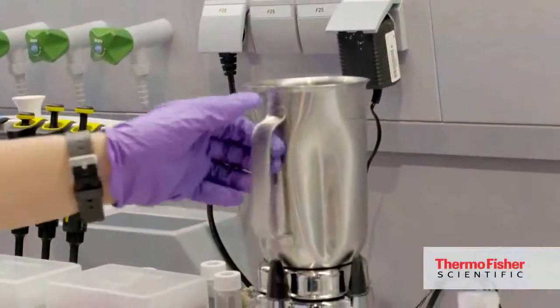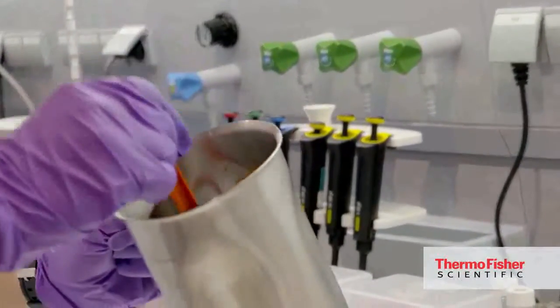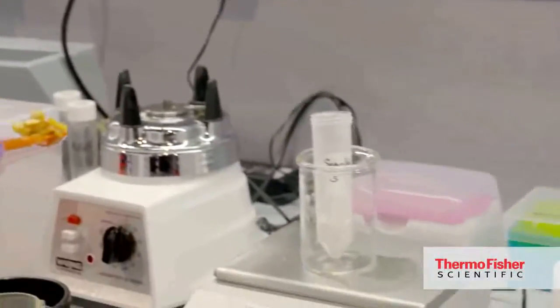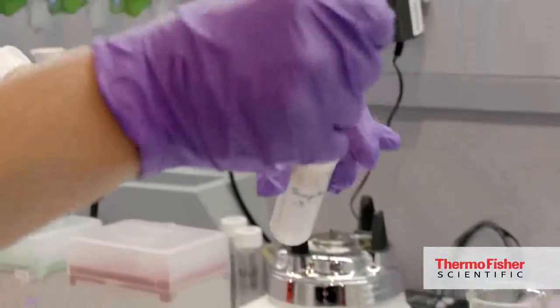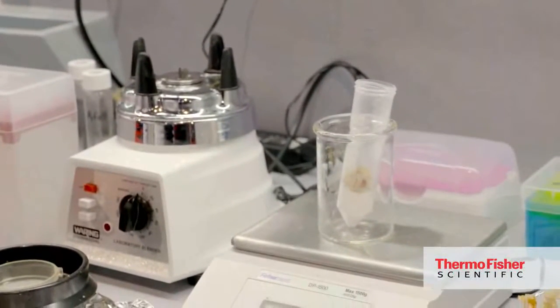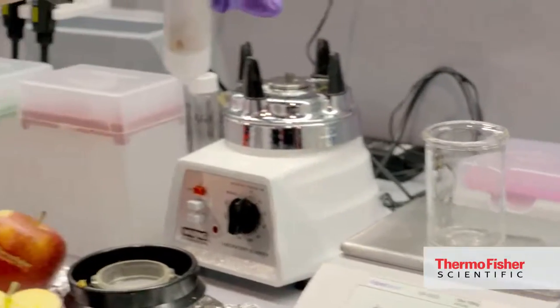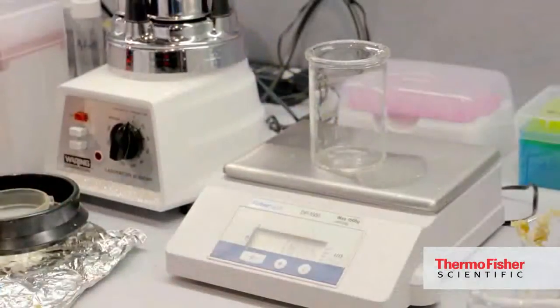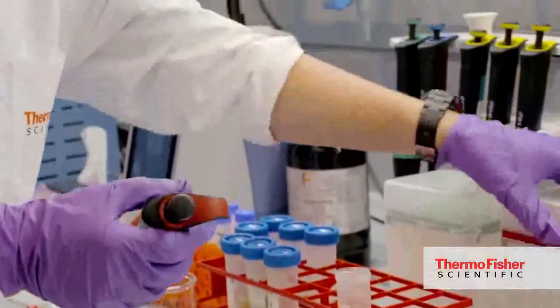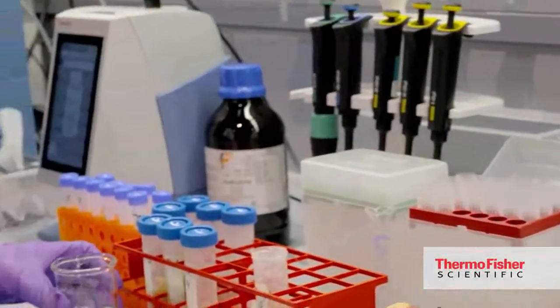So we have the homogenate. We take the homogenate for the classical QuEChERS method, in a very similar way as we did for the ACE extraction. So we weigh 10 grams of sample directly into the extraction tube, which is a pre-prepared tube. It already contains some salts. It can also contain buffers. So whenever the sample is weighed, then extraction solvent will be added to it. To 10 grams of sample, we add 10 milliliters of solvent.